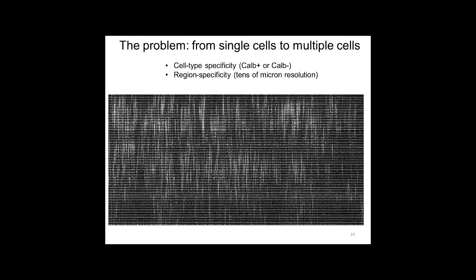So that leads us to the problem. These very detailed approaches in terms of cell identity are not suitable to scale from the single cell to multiple cells.